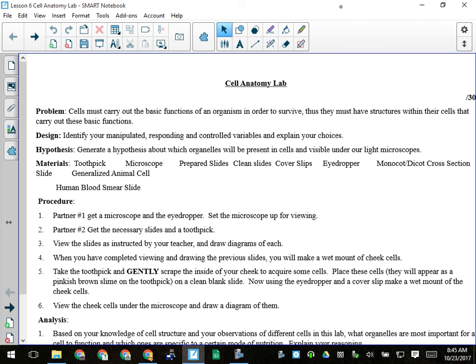What I always tell people is when you look at the nucleus, look around the edges of it. It's not going to be a perfect circle, and sometimes it's going to look like it's got a beard. Like on one side, if it was a face, there's always this blurry, fuzzy thing on one side of it, and that's usually the rough ER. So when you're looking at stuff, you can use your reasoning, rather than your imagination, to figure out what things are.